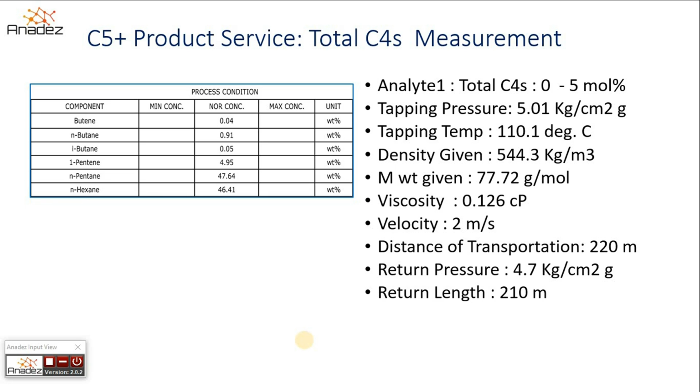Hello everyone, this is another demo video on Anadez. In this video we're going to look at a liquid GC application. The previous video was about a vapor GC application.